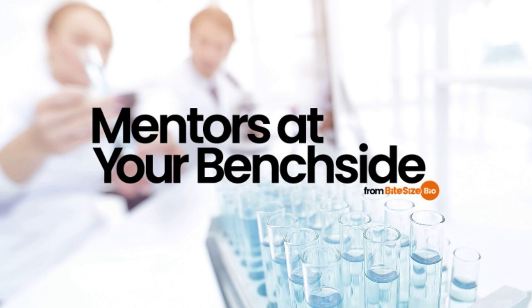If you use DTT in your protein preps and use A280 to measure protein concentration, then be careful. DTT oxidizes over time, yielding a product that also absorbs at 280 nanometers. This doesn't mean that UV-vis is incompatible with DTT, it just means that you should use a buffer with an accurately known concentration of it. This can be difficult to do, especially if you freeze protein and use it for weeks or months, since you may no longer have the exact buffer to blank against, in which case some of the following techniques might be more useful for you.